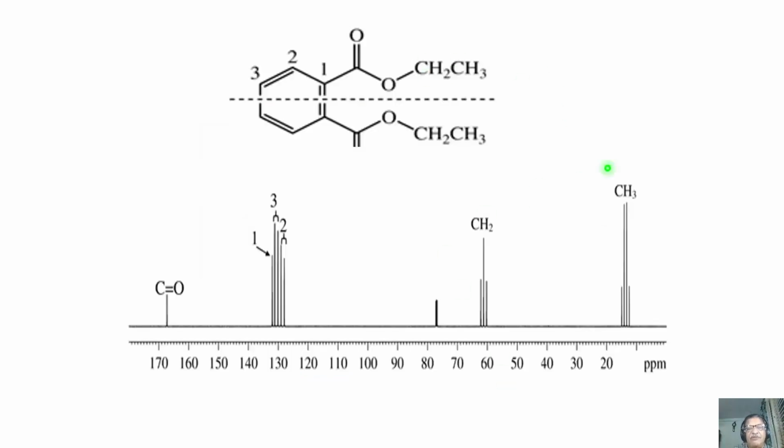Now, look at the spectrum of this molecule. We have a molecule like this, a realistic spectrum. We have a CH2 and a CH3. What were we seeing in the proton spectrum? These 3 protons coupled to these 2 protons, and this made it a quartet. These 2 made these 3 protons a triplet. There was a coupling between the 2 protons through the chemical bond. Now we are not worried like that. This carbon is coupled to these 3 protons only. As a consequence, you see, it is a quartet. This carbon sees these 2 protons, so it is going to be a triplet.